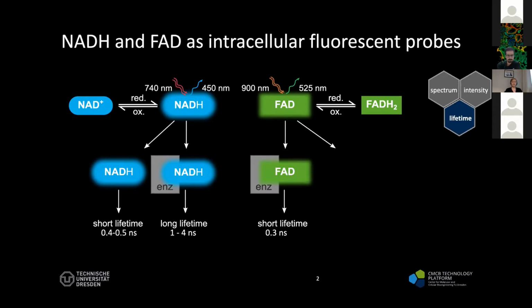Here, the lifetime is even shorter, in the range of 0.3 nanoseconds, while the free FAD has the longer lifetime in the range of 2 nanoseconds. All of this has been nicely introduced also on the first 2 days of the talks by Ammasi Periasamy and also by Angelika Rück. But this is just a small update and reminder for everyone who had not joined earlier.